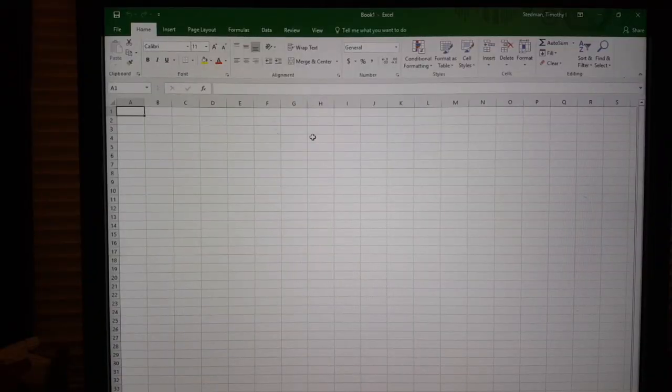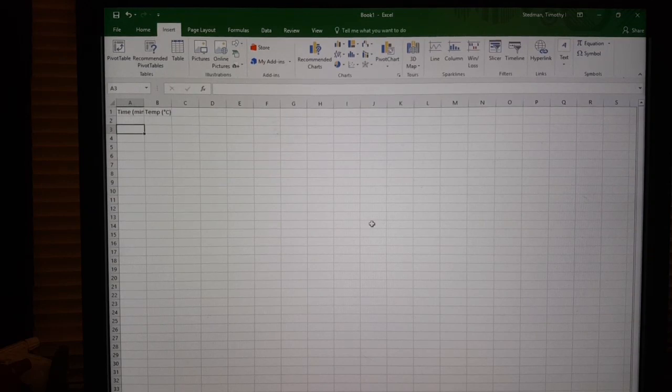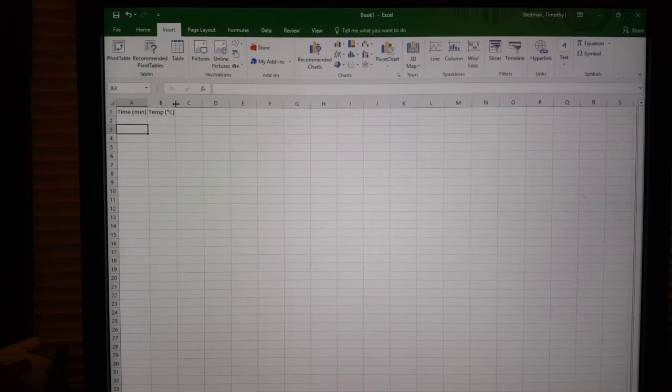Your first challenge is to set up your spreadsheet. Just follow the directions in the lab and you'll end up with columns that are too narrow. If you put your cursor in between the columns and drag, you can make them the width that you want them to be.